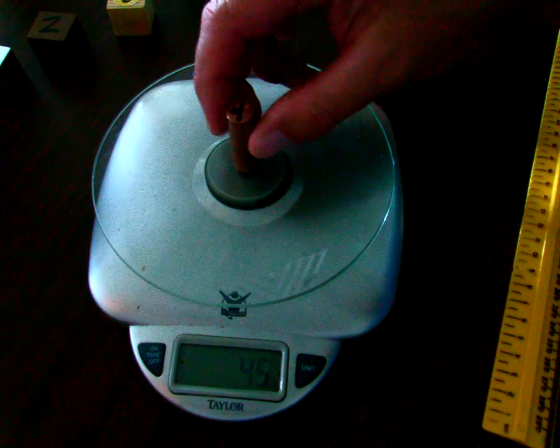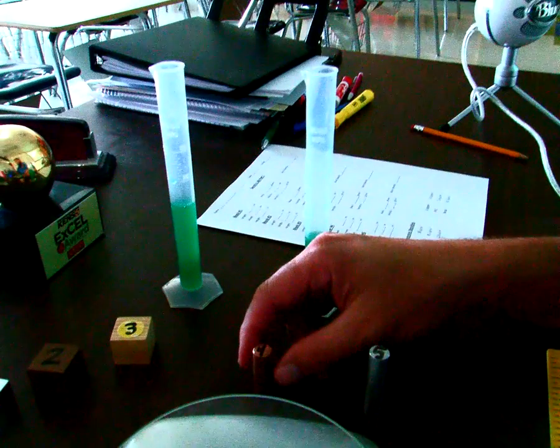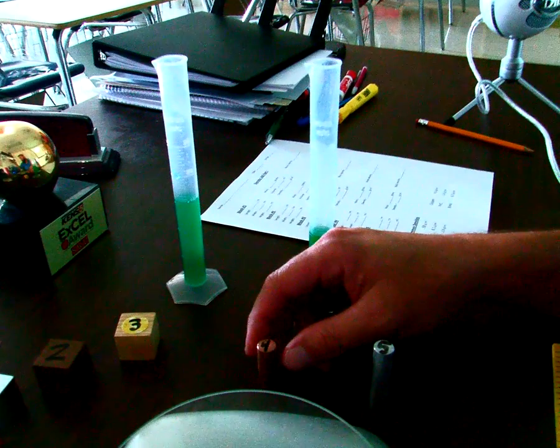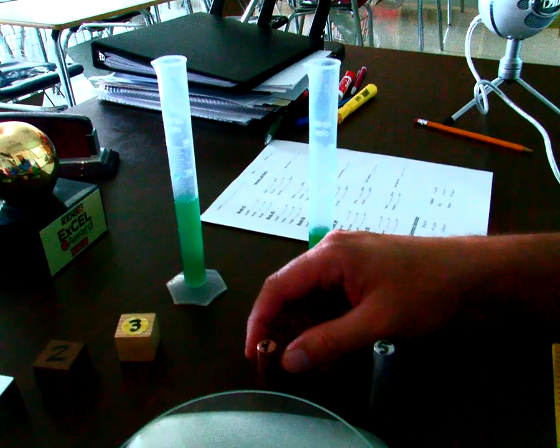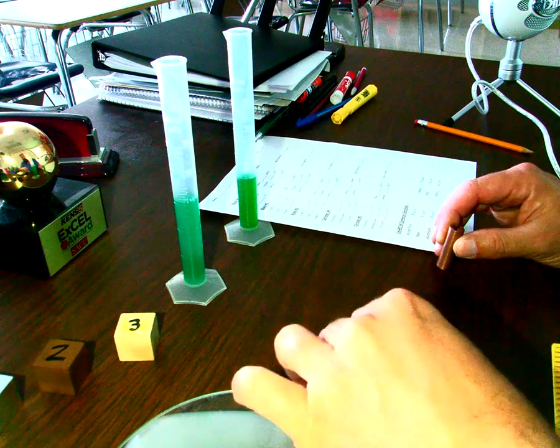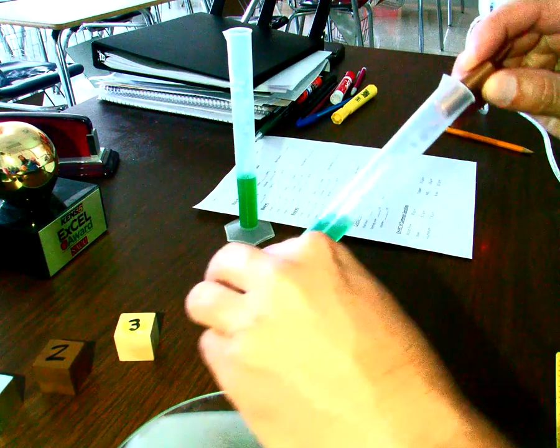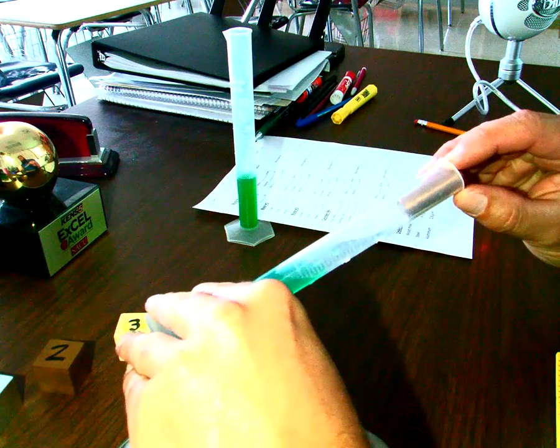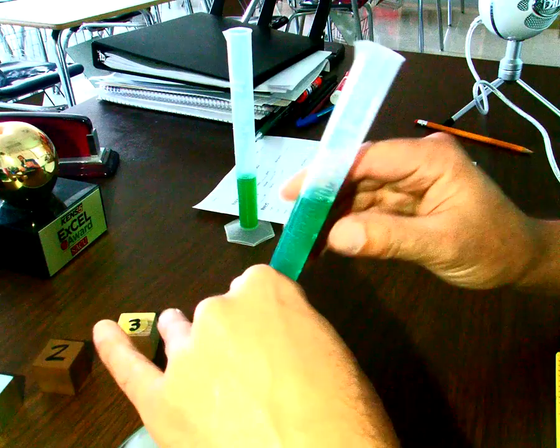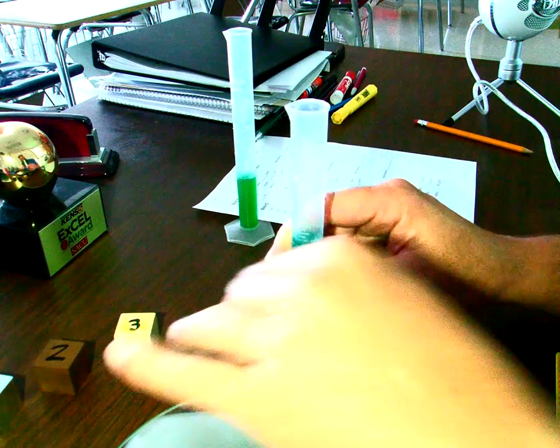And we are going to put cylinder number 4 into our graduated cylinder that has 15 milliliters of water. So I'm going to slide this one out of the way, and I'm going to gently tilt this over so I don't spill any of our colored water. Let that gently go down. Small bubble there on the side. All right, there we go.